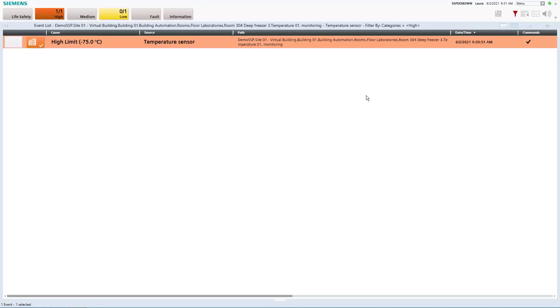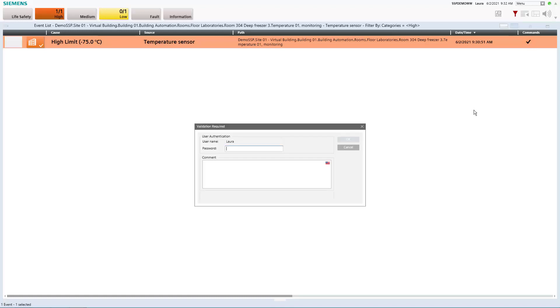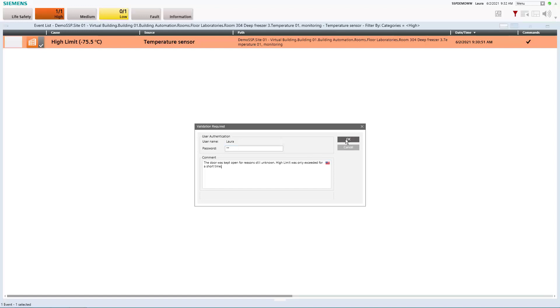And what we now still have to do is we have to acknowledge this event but since this temperature sensor is a so-called validated object which means that it cannot just be manipulated or changes are only allowed by authorized persons. This also means that now when we try to acknowledge it the system will prompt us first of all to enter our password again to make sure that it's really us performing this action. And we also have to add a comment which is then stored in the audit trail for documentation purposes.